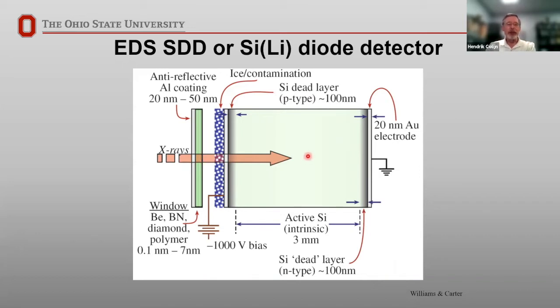So basically, it would take 3.8 eV to generate one electron hole pair. So when you start getting down to some of the lighter elements where your X-rays are in the few hundred eV range, you're actually detecting only, well, for carbon, it would be about 70, 75 electron hole pairs, which is pretty impressive when you think about how much you're having to amplify it to detect things.